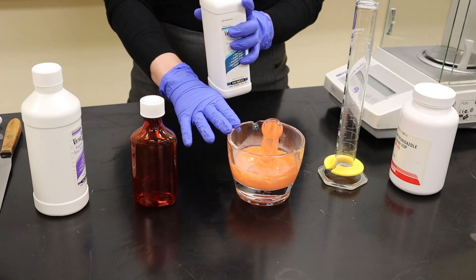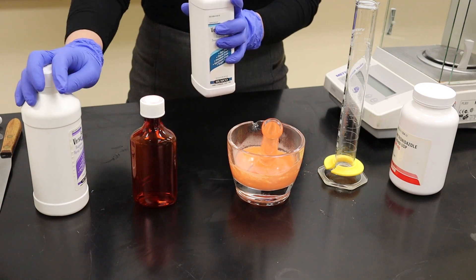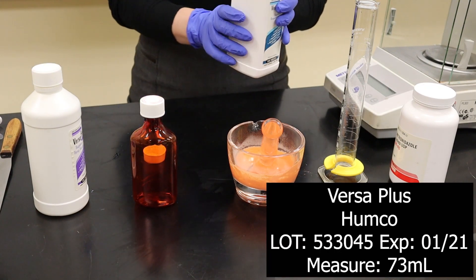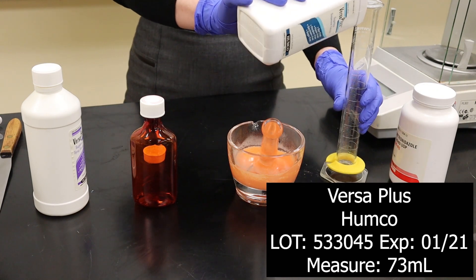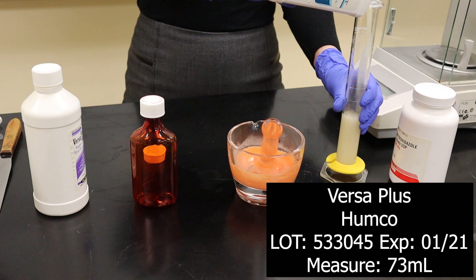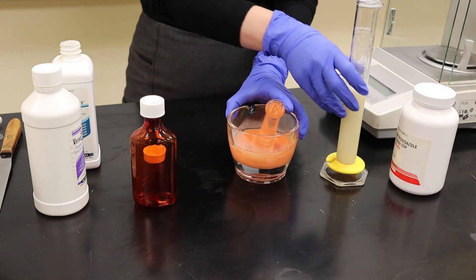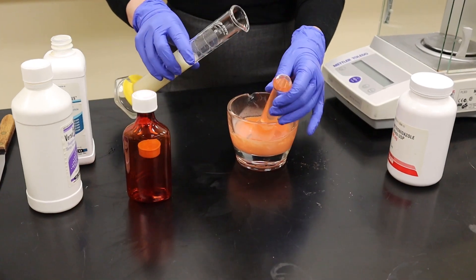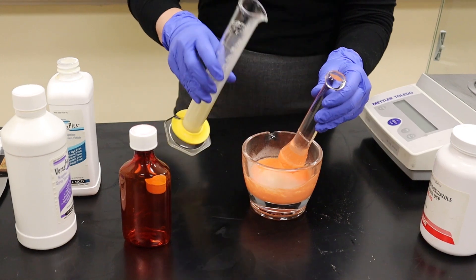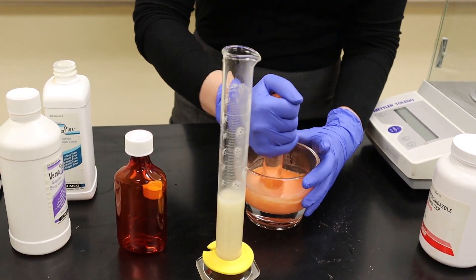Now I'm going to measure out my VersaPlus and my VersaFree. Since it took me about 5 ml of glycerin to wet this powder, I'm going to have 145 ml remaining using a 1 to 1 VersaPlus and VersaFree. I'm going to add this into my wetted powder in about two to three different portions, and triturate to mix it together and to suspend my powder.